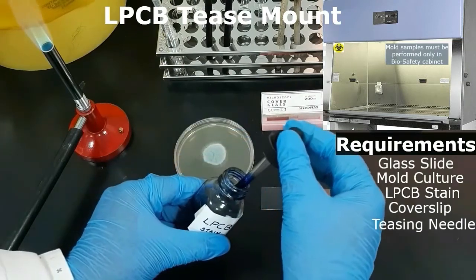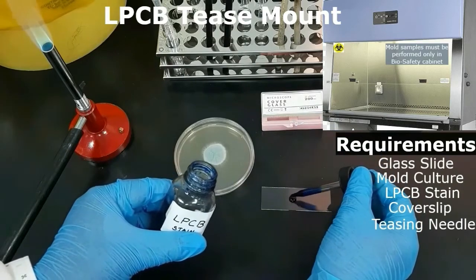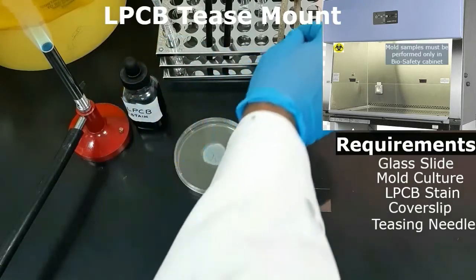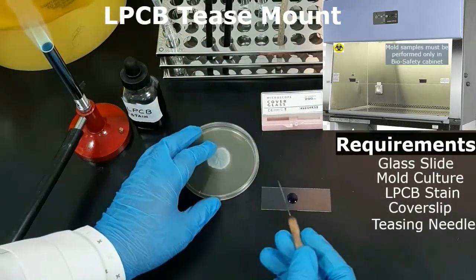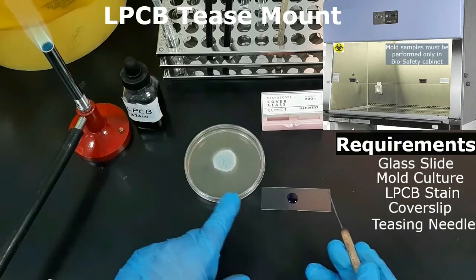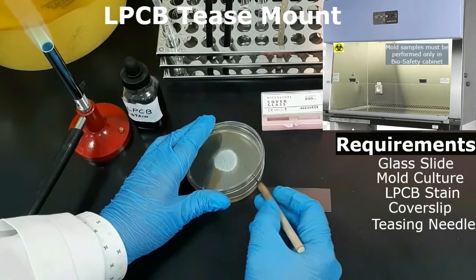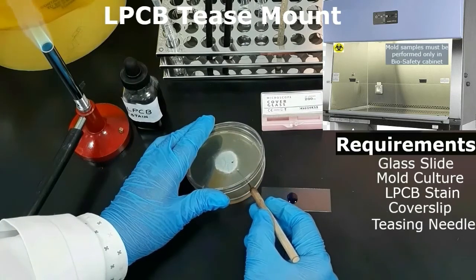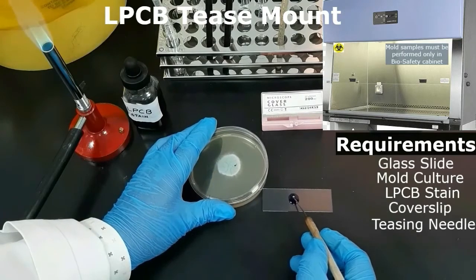Place a drop of lacto phenol cotton blue stain on a clean glass slide. Open the culture plate and use a sterile teasing needle to scrape some fungal colony from the agar plate, and transfer the scraped specimen to the slide containing a drop of lacto phenol cotton blue stain. Note that the slide and the fungal culture plate should be kept nearby.